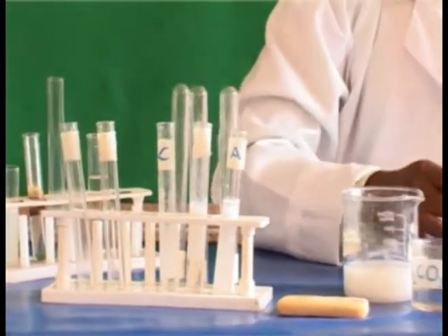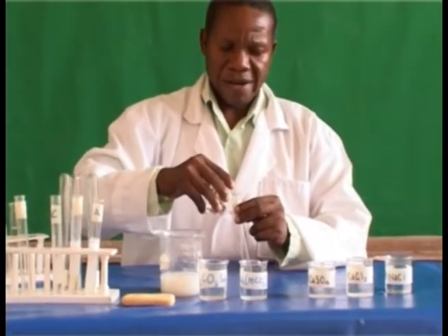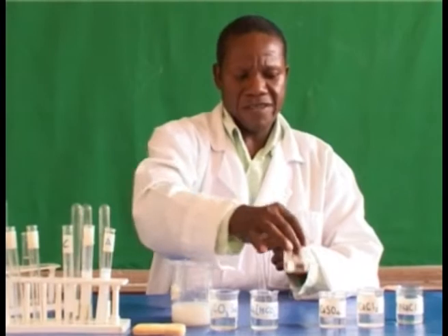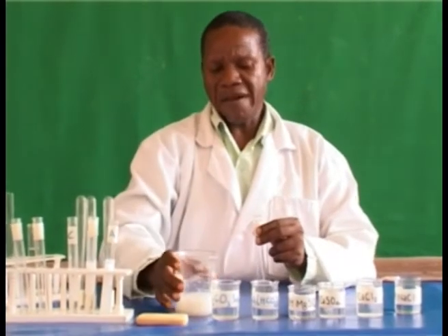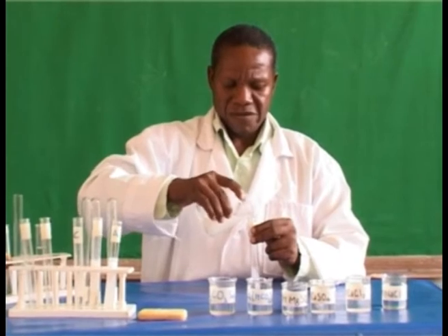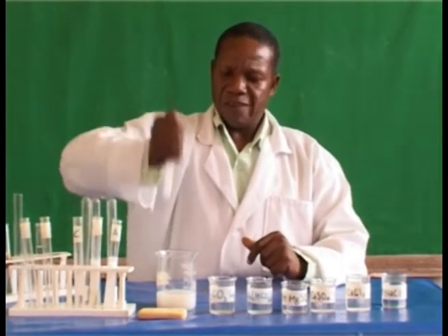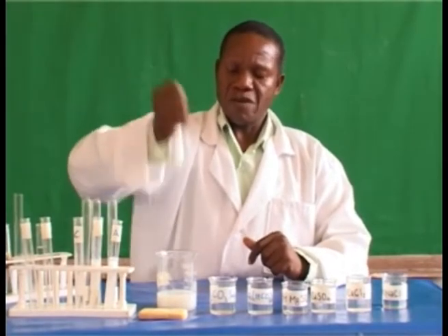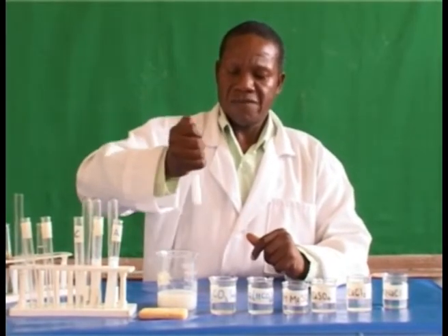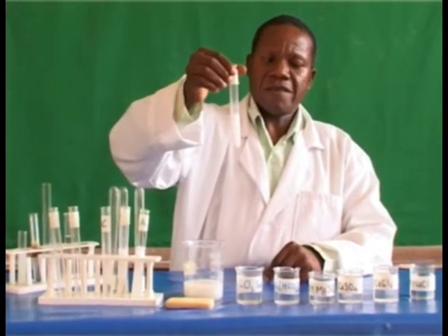Test tube D: put a small amount of magnesium sulfate, followed by soap solution. Check if the lather will be formed or not. There is no lather formed.